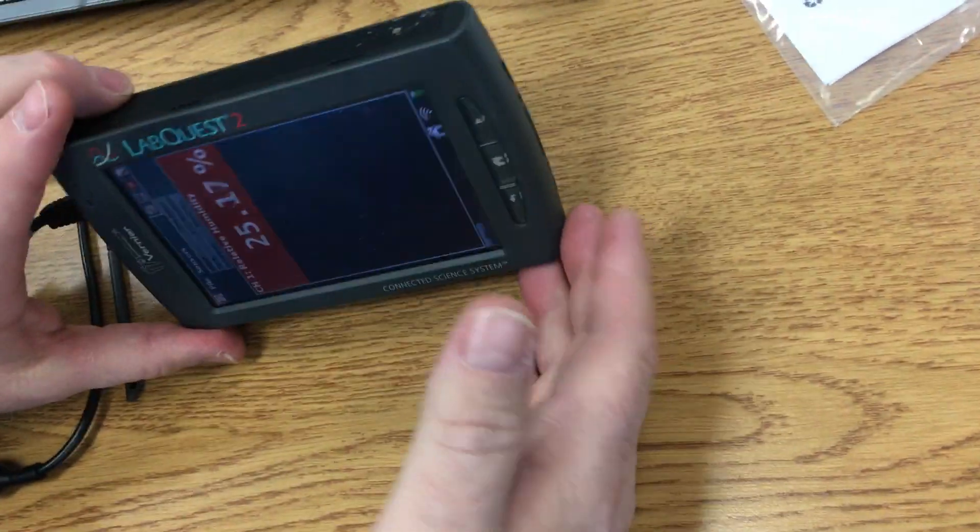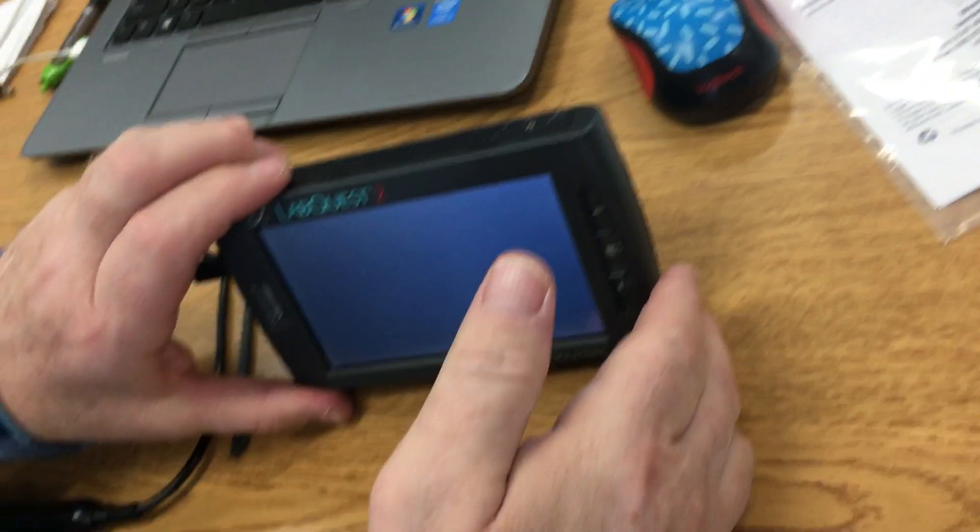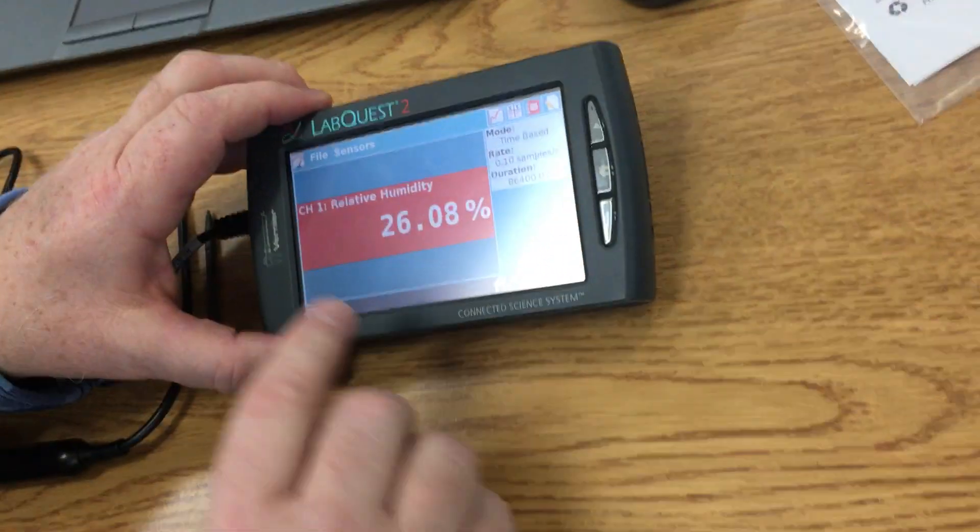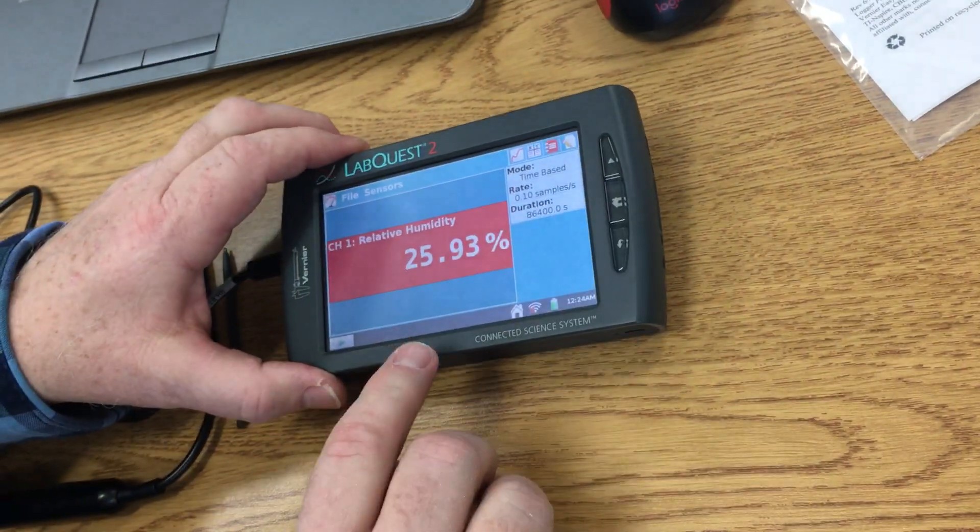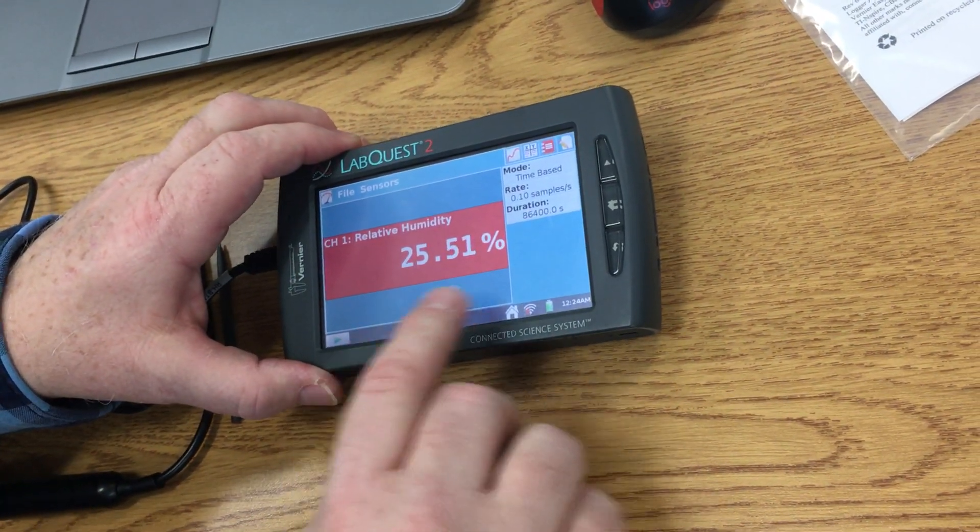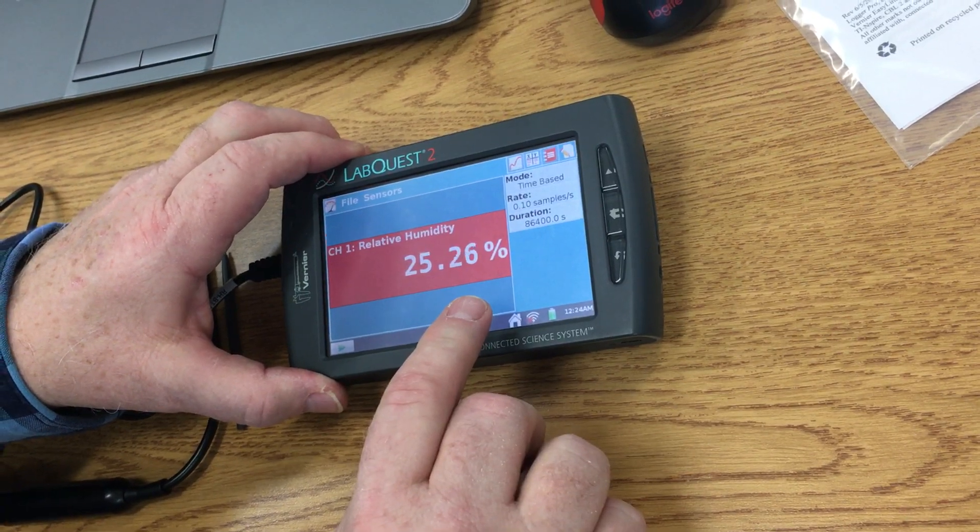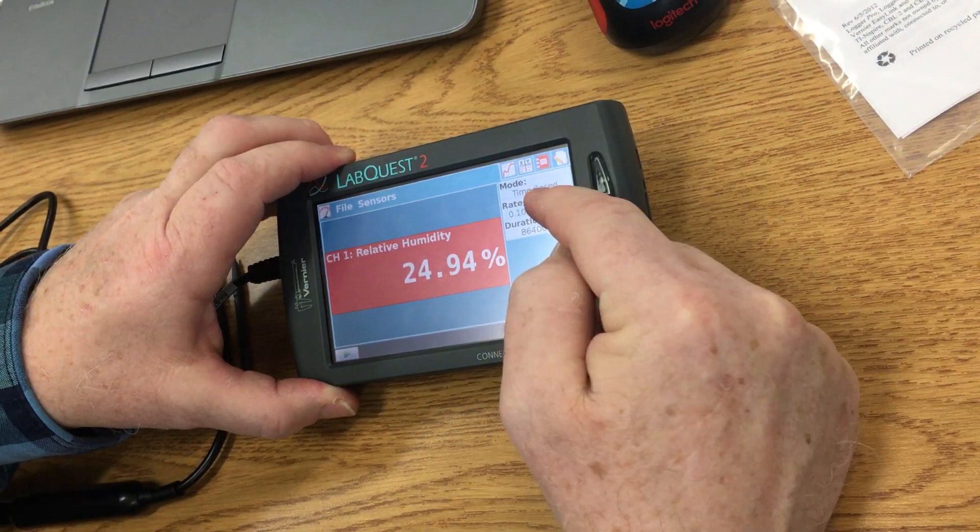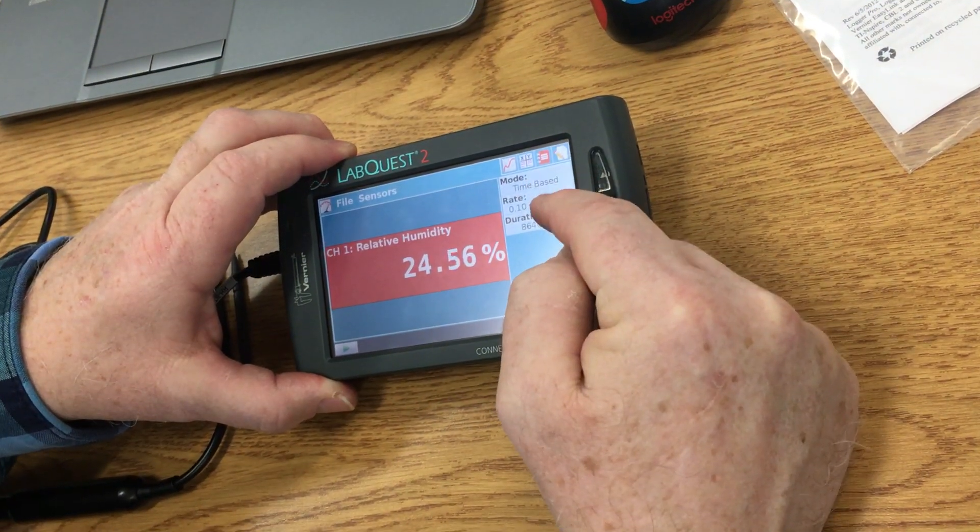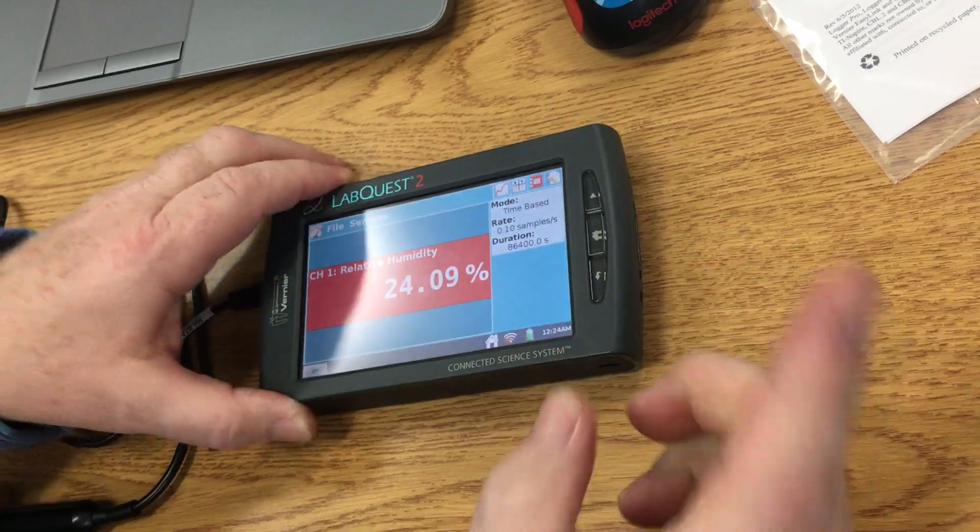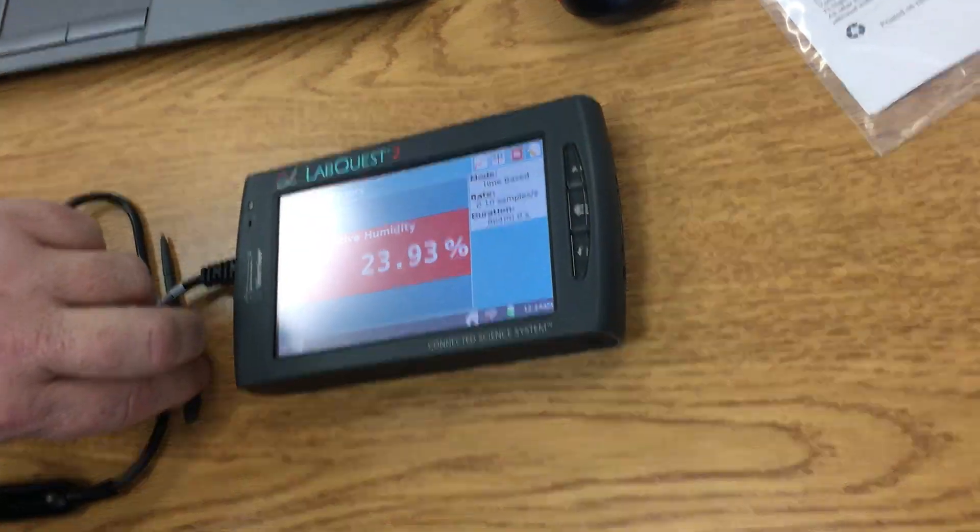Notice it immediately changes to begin reading. Notice it says right now our relative humidity is 25.51%, but it also changes the time based and the samples, so we're going to need to fix that.